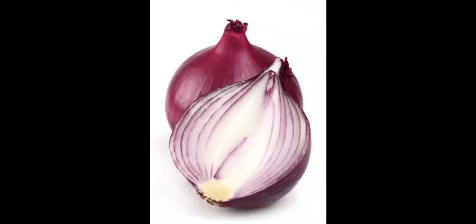So in this lesson, that is the cell, the basic unit of life. Second and fourth activity we have related to the onion. In the second activity, the aim is observation of onion peel cells, whereas in the fourth activity the aim is observation of the nucleus in the onion peel cells.